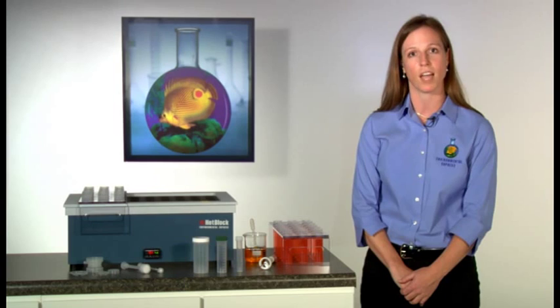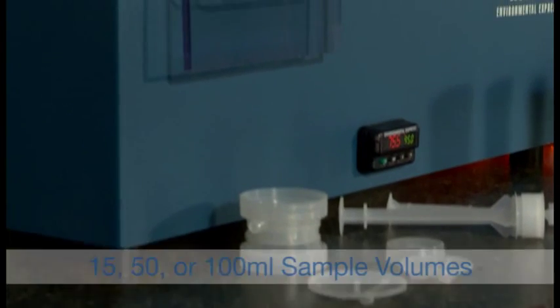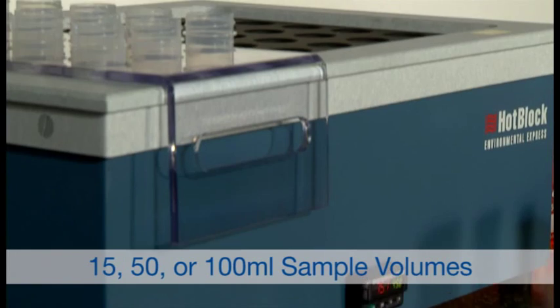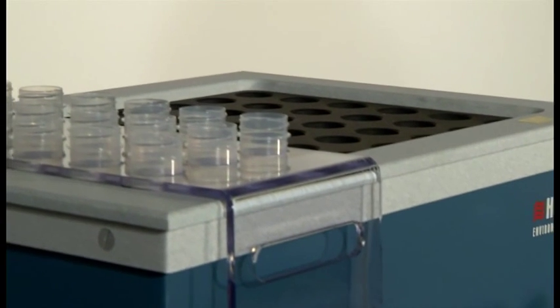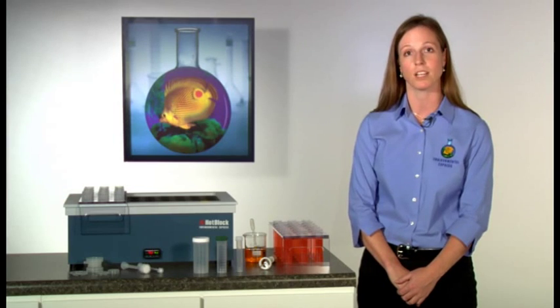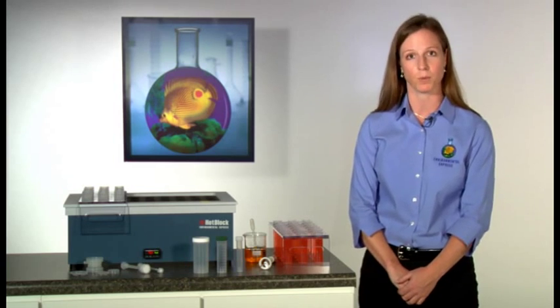Our blocks are designed with wells to accommodate sample volumes of 15, 50, or 100 milliliters and are designed for use with the Environmental Express digestion vessels which are disposable polypropylene.